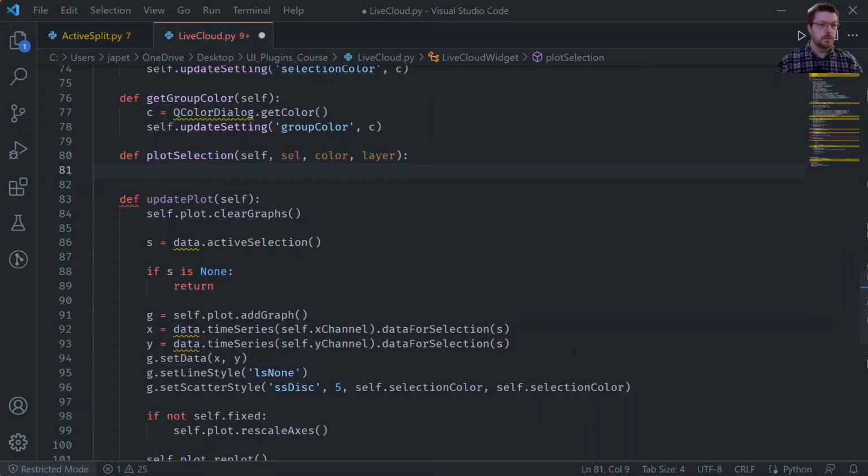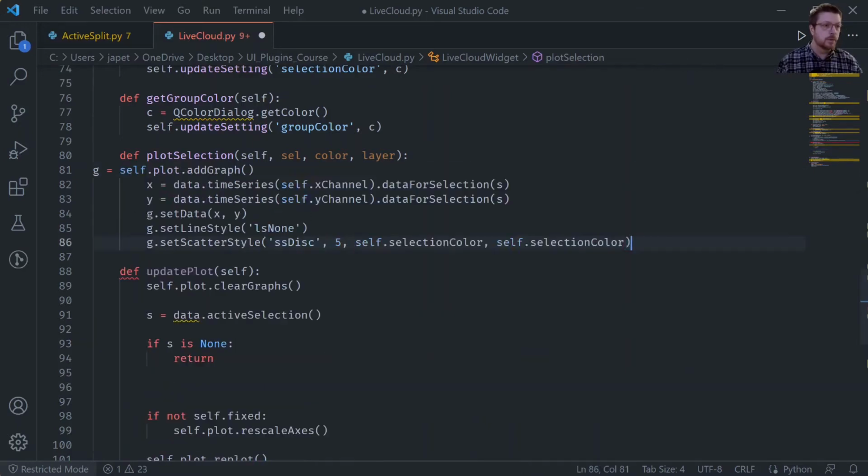So we will do this again. So basically, we can grab pretty much all of this code, and it's going to go in here. So we'll get the X data. This is now cell. It should work. That should be fine.